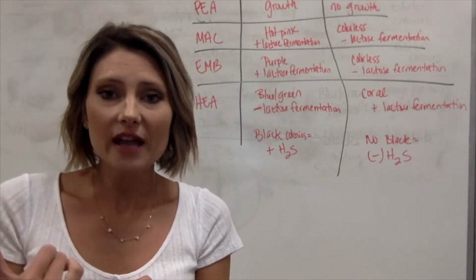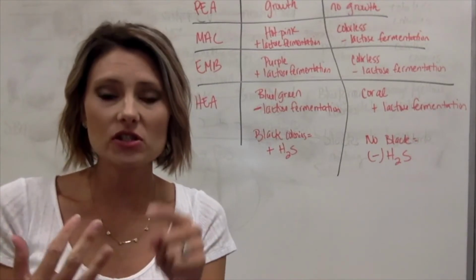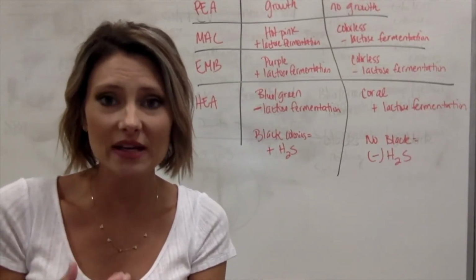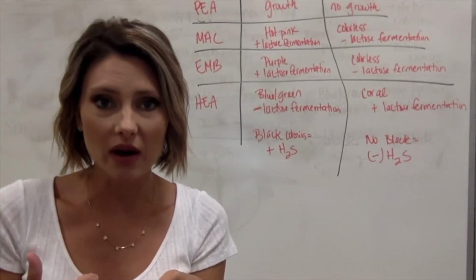So they're all selecting for gram-negatives. So only gram-negatives are going to grow. And the substrate for all of these is lactose. And we are looking at fermentation of that lactose. So can the bacteria ferment the lactose, yes or no? And that's the question that we're asking.